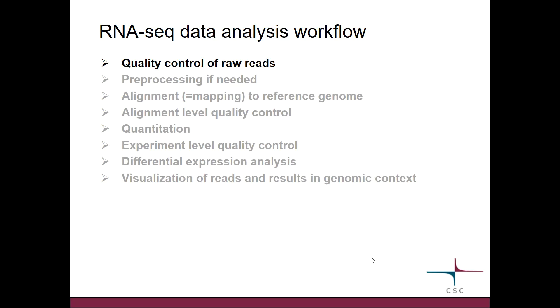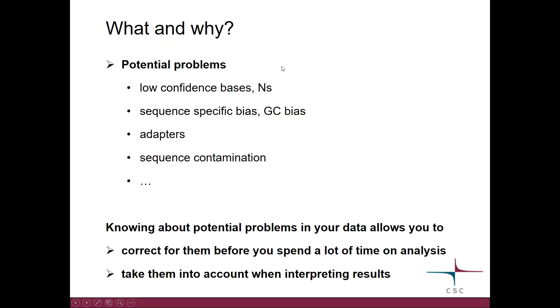Let's start our data analysis workflow and discuss the first step, which is the quality control of raw reads. So why should you care? Well, the reads can have several problems. Some of the base calls might not be correct. If the machine cannot guess at all, it will place N instead of one of the bases. There can be different kinds of biases in the data, there can be sequencing adapters left, or there can be sequence contamination. Knowing about these problems is useful because some of them you can correct for before you spend a lot of time on data analysis, and some you cannot correct, but at least you can keep them in mind when interpreting results.